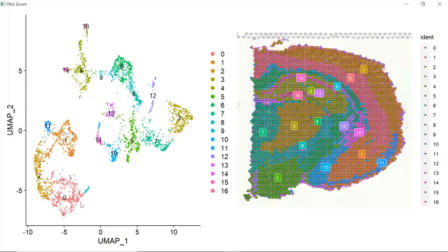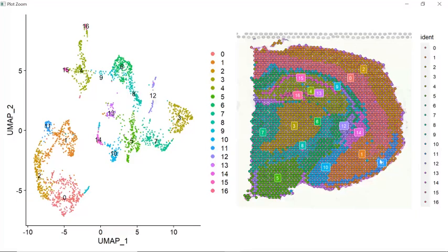For example, here you can see cluster 0, cluster 1, cluster 2, and cluster 11. They are the spots in the cortex region.